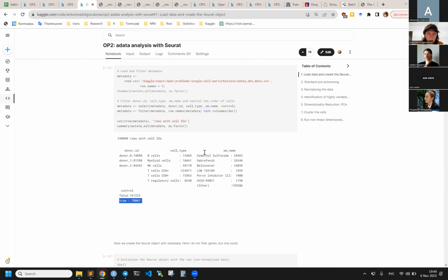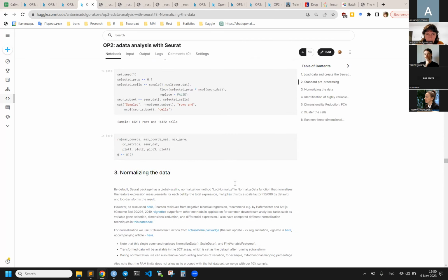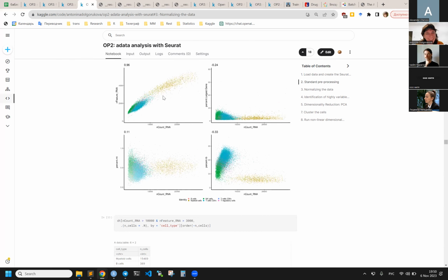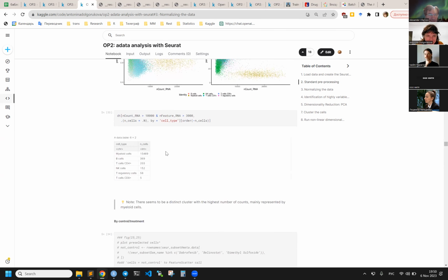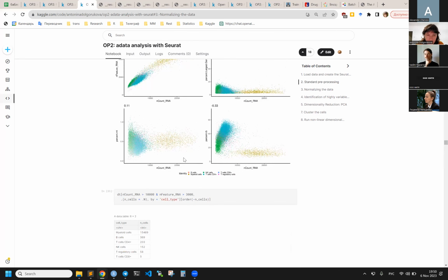So we go back to our Seurat analysis. Where are we? We were here. Maybe we are still wrong, but have you colored these by the drugs? I tried, and it is just equally distributed. Very, very many colors here, and no patterns. I didn't show this picture, nothing to show because of this.